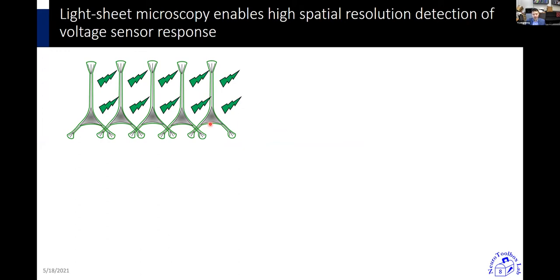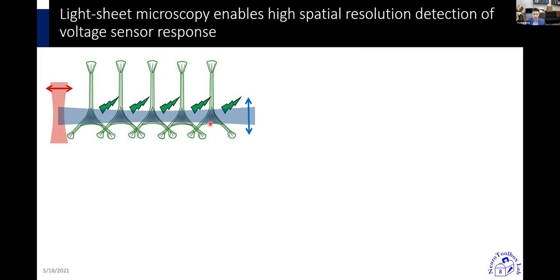The basic idea is to pattern the illumination so that we don't illuminate lots of stuff simultaneously. This can be done by light sheet, where a sheet of light can be scanned up or down, or this can be done by a variety of 2 photon, including the extended Bessel beam Professor G just mentioned, that can scan laterally. And all of this is meant to reduce the out-of-plane fluorescence, so we can just focus on one layer or one section of the brain at a time.